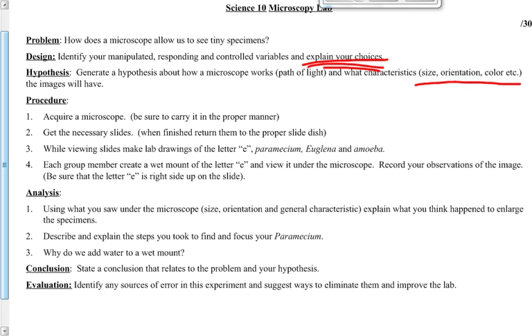Now you can take it home and do a really good copy of the diagram whenever you want. If you want to do a rough drawing while you're looking at it, that's fine, but then you're always going back, looking at your paper, and looking through the microscope, and looking at the paper. It kind of is a pain in the neck. So you might just want to snap a picture of it and then just draw from it, looking at it on your phone. It does work pretty well once you get the angle on the camera right on the microscope.